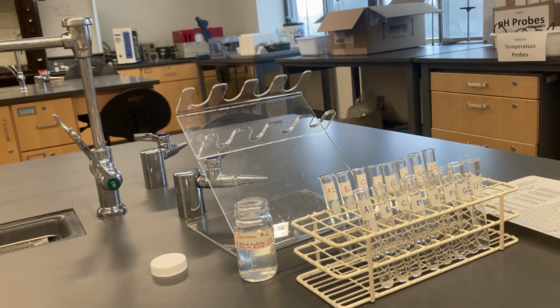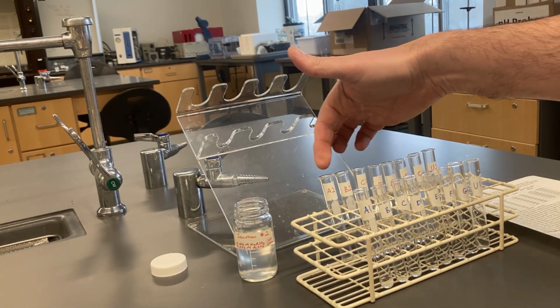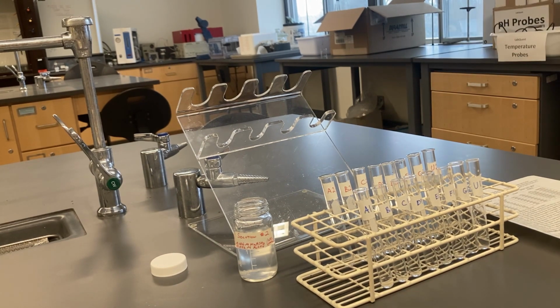And so again, I'll bring all of these up to 1,000 microliters by adding the water. So I'll add 800 microliters to all of them except F2. I'll only add 600 microliters to F2. And that'll have all of our test tubes set and ready for our reaction.